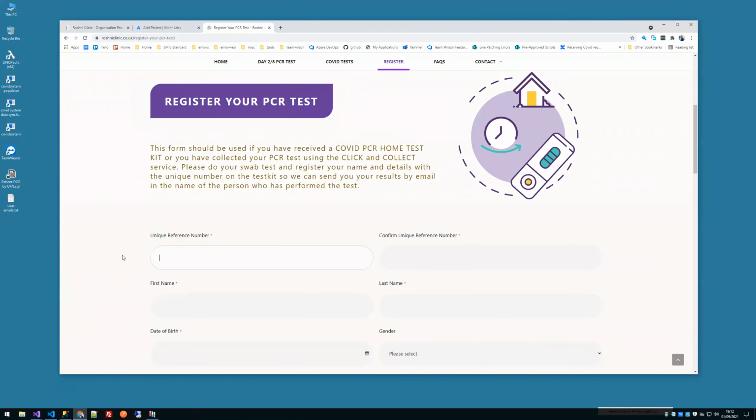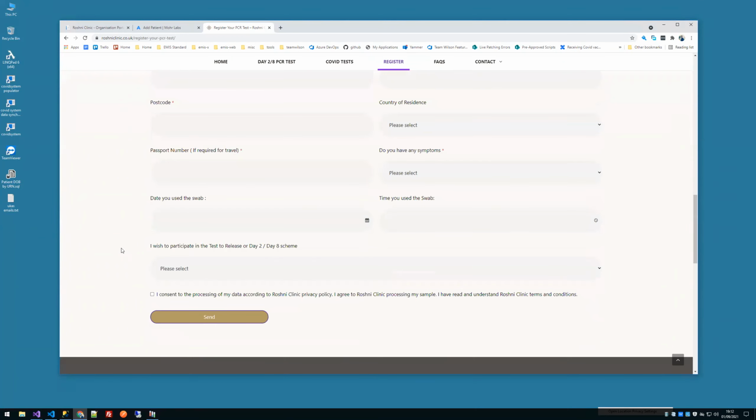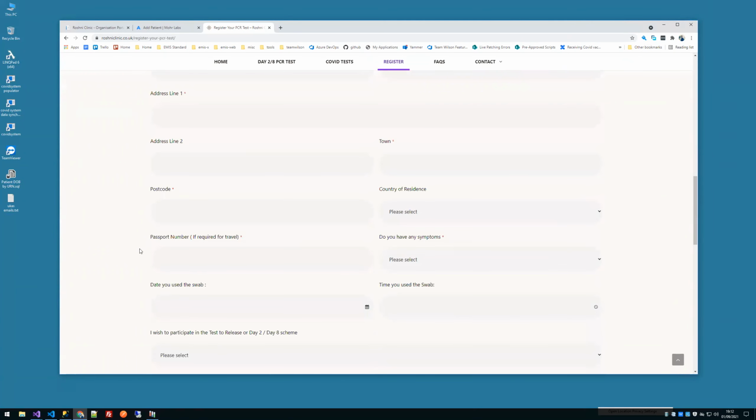So when someone purchases on their website, are they entering their passport information and everything, or are they just purchasing a kit and that's it? And then they register it all at a later date? So there's two models. One is where you can enter everything in, and then the second is where we come in to register your kit, and you can bring that information back.